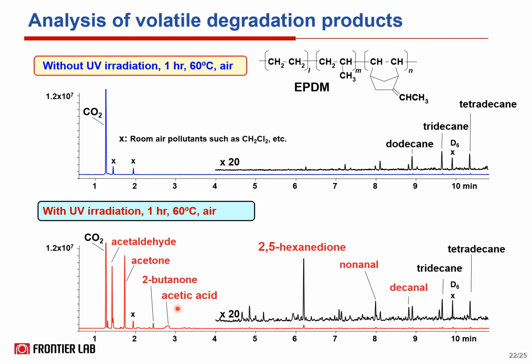They are originated from the propylene content. Also, straight-chain aldehyde, such as nonanal, were observed. The photo and thermal and oxidative degradation of EPDM was evidenced by these results.